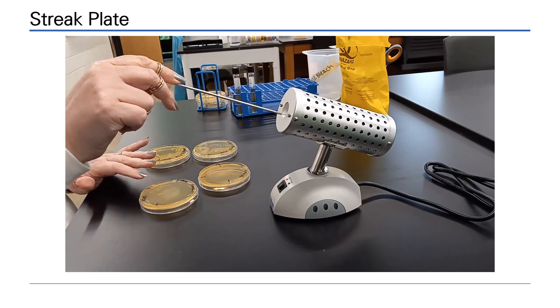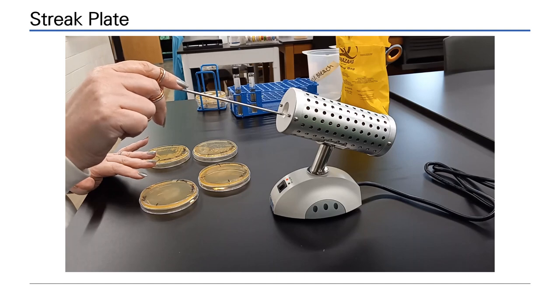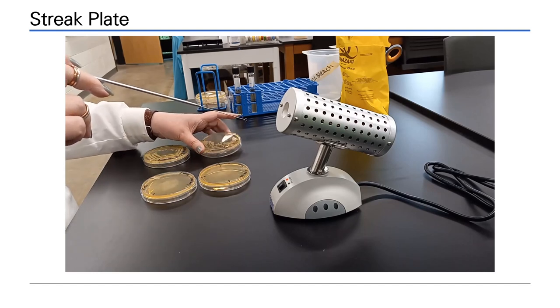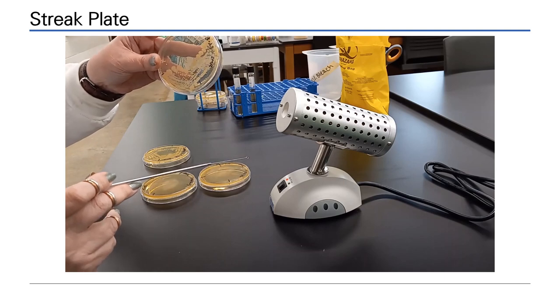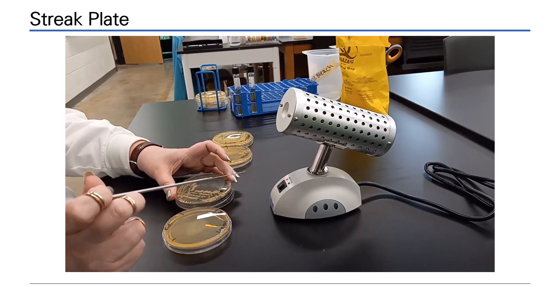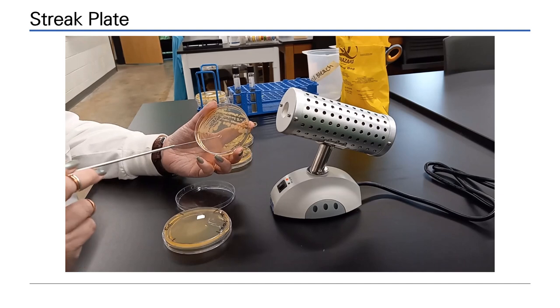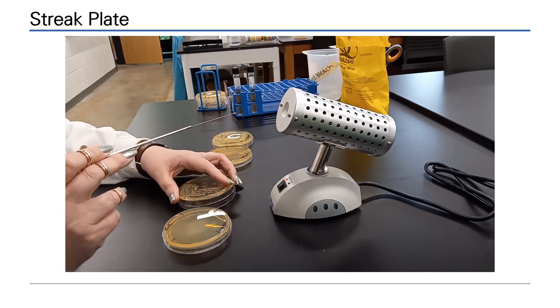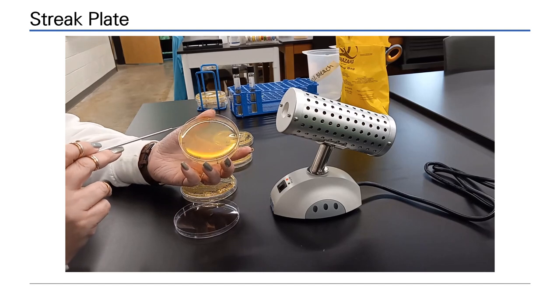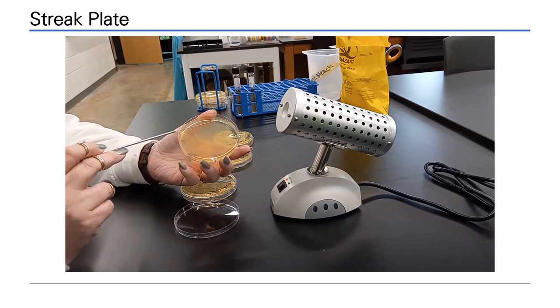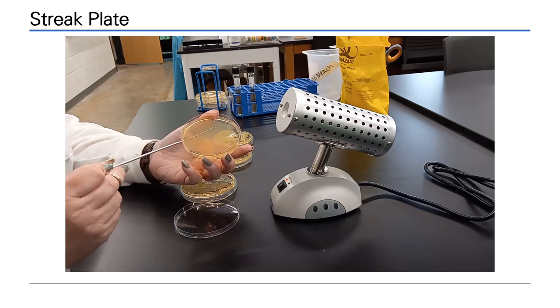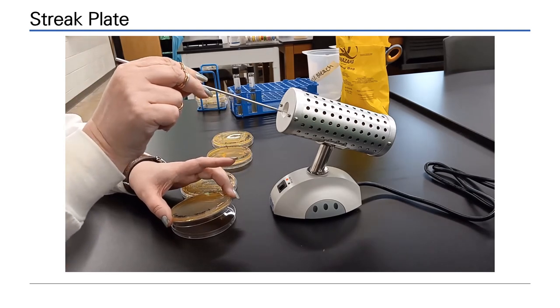Begin by sterilizing the inoculating loop. Using E. coli first, on an organized workbench, we will aseptically remove a small amount of growth. In the first quadrant of the sterile agar plate, we will inoculate E. coli in a dime-sized area. Now the streak begins. Four streak lines are usually enough for a quadrant.